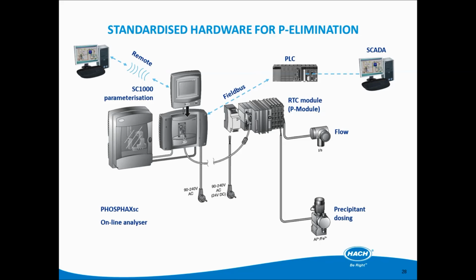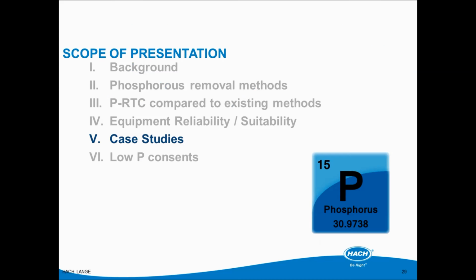Here we have a typical installation of a PRTC system, and it's showing its interfaces with the rest of the works. In the next section, we will look at two case studies using PRTC.